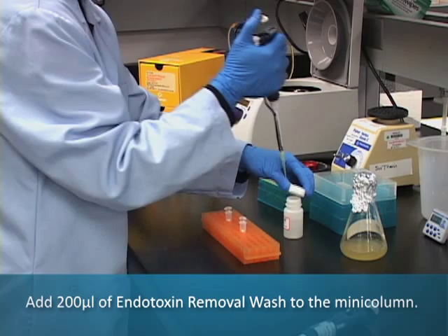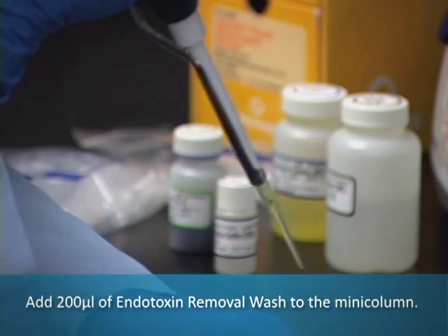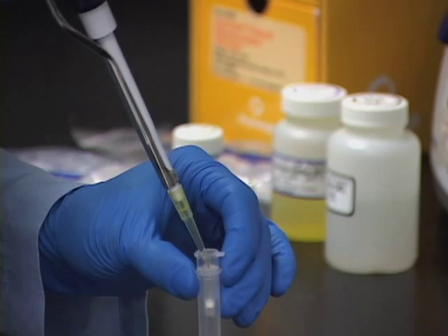Next, add 200 microliters of Endotoxin Removal Wash to the Mini-Column and centrifuge at maximum speed for 15 seconds.